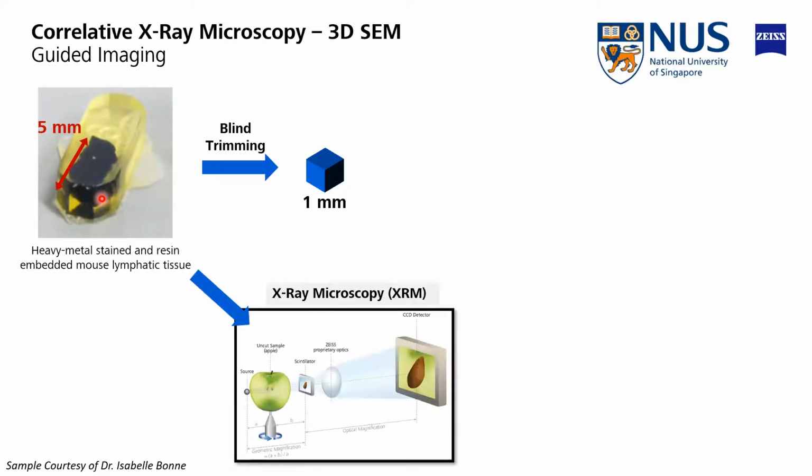If you followed the talk from one of the previous webinars by Rosie Manzer, she probably told you everything about X-ray microscopy. I just quickly keep that sketch here to run through it in a very high-level overview. You have an X-ray source, you have a sample in the center, and then a detector on the right side, and we can magnify that even further.